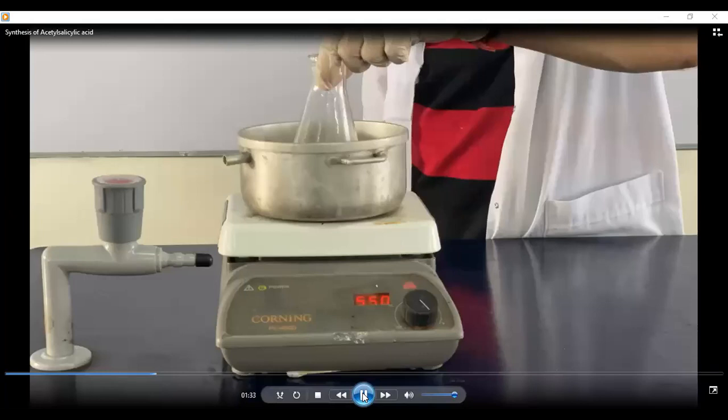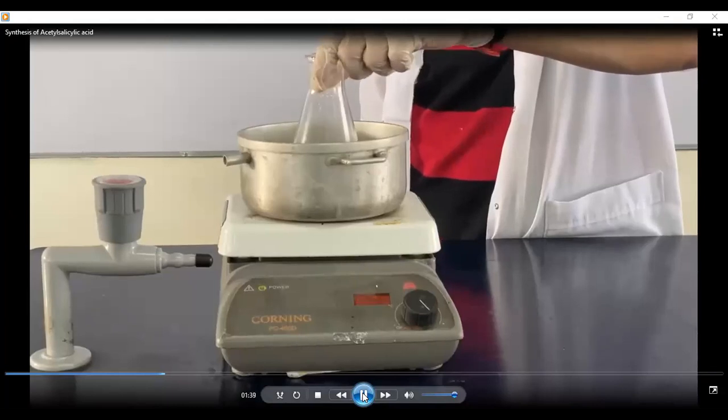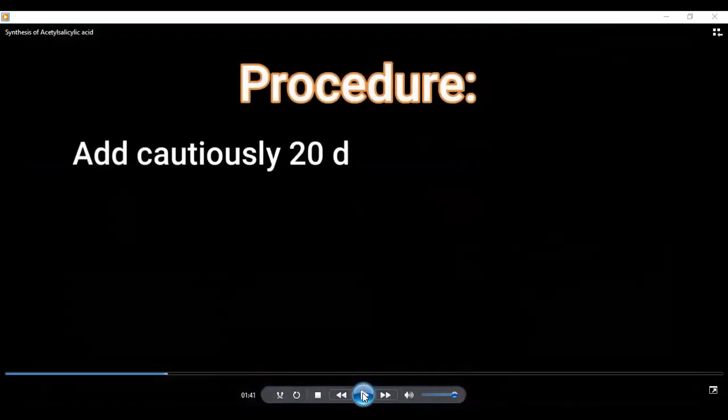And then after the acidification of that chemical, we heated the mixture in a warm water bath. Maybe you noticed that during heating in the water bath, I was holding the Erlenmeyer flask. Supposedly it should just be left in the water bath, but the water was already boiling.